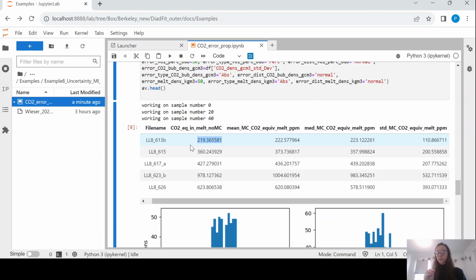You then might want to take your SIMS data and you might want to add, in addition to adding in this CO2 in the bubble, adding the standard deviation. And that would give you an upper limit of the CO2. So you'd basically be adding 340-ish rather than 220. You then might want to run the saturation pressures again, minusing that standard deviation. And then you basically have 3 saturation pressures for each melt inclusion. You have the mean and you have the standard deviation.